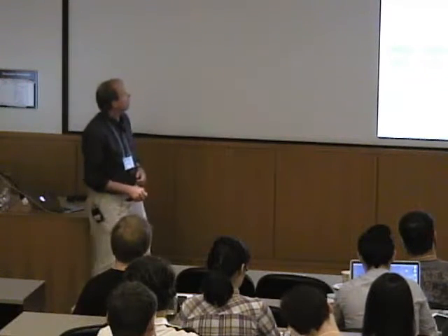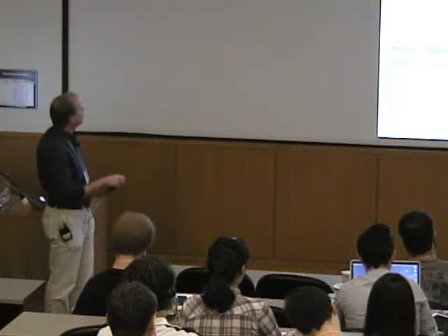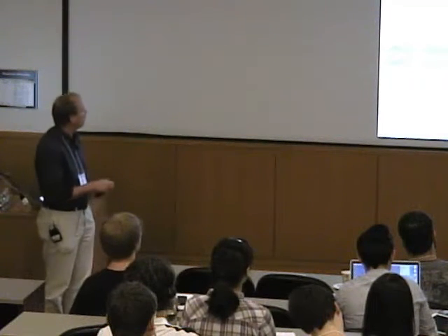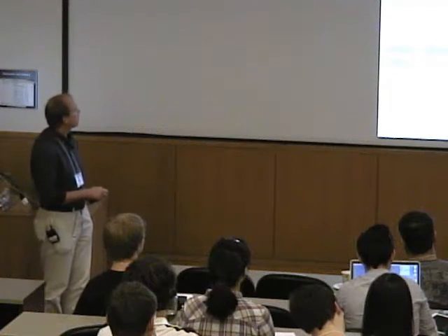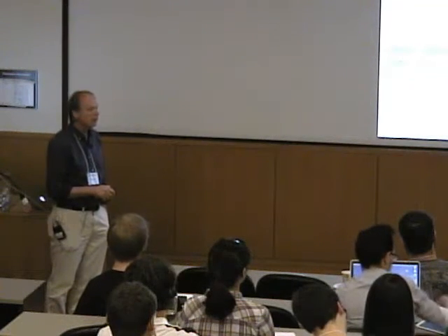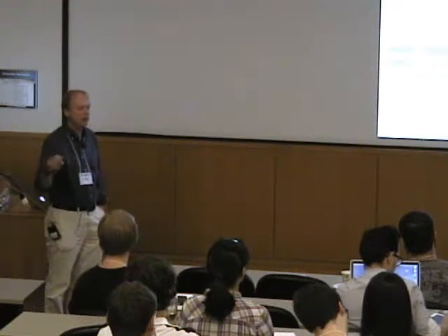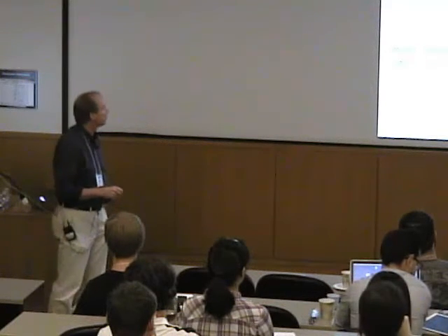Okay, so this is a picture of a commonly used resonator, right? And we have a waveguide here at the back, which brings the microwaves down to the resonator. In the microwave region, this is the typical way that we would transport the radiation. It's at a wavelength or frequency which is too high to be passed through a cable easily. Can be done, but it's a bit difficult, right?